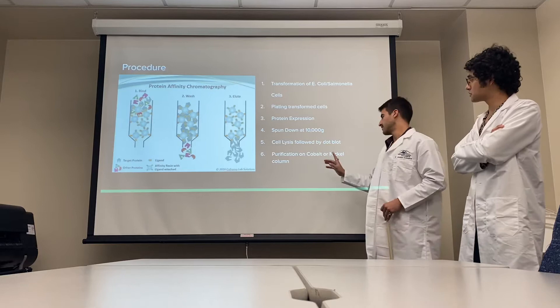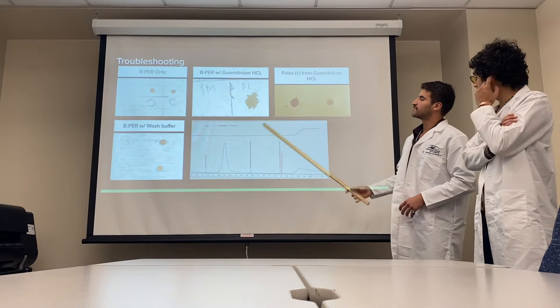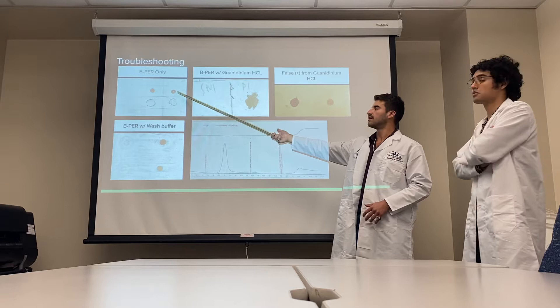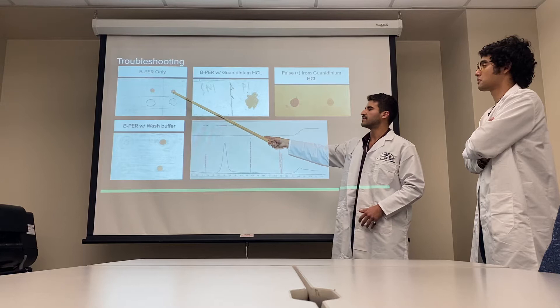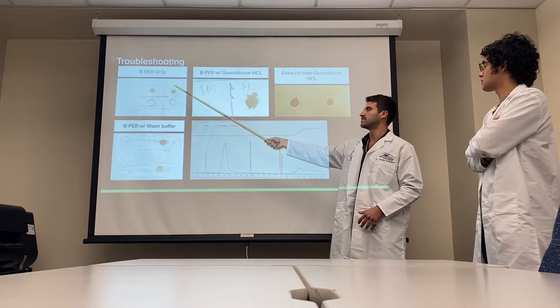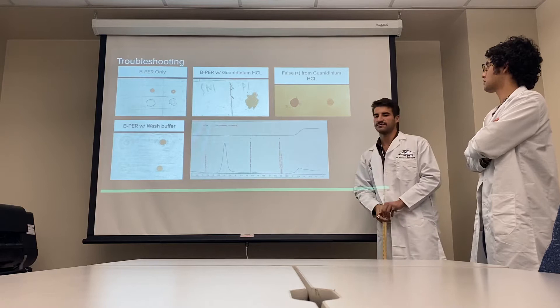Here was the troubleshooting process. We used B-PER only — a detergent used to break down the cell wall of the bacteria. Here is the pellet and the supernatant. The pellet is very dark, indicating that the protein is there. The supernatant has basically nothing in it, which is unusual given that our protein is typically a periplasmic protein.